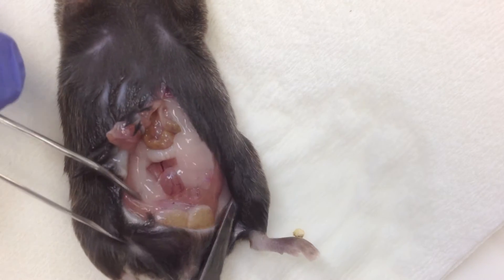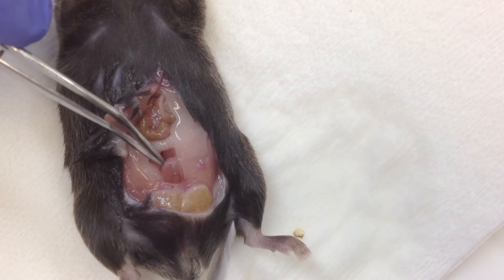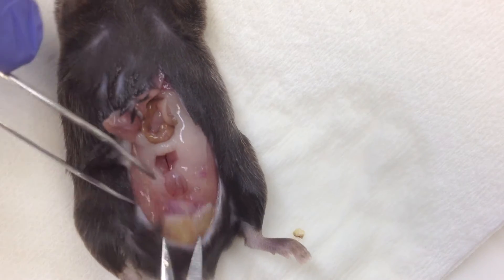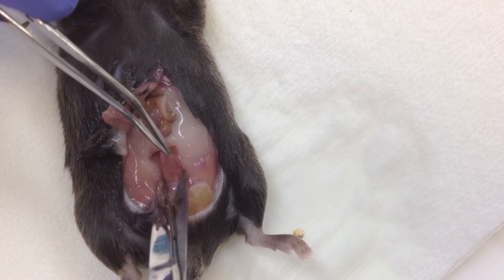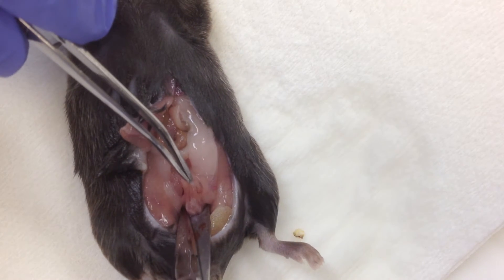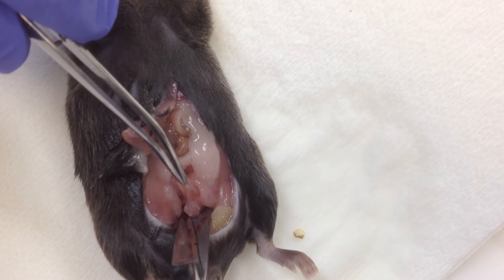Locate the bladder, which is as observed right here. What you want to do is insert the scissors on either end of the bladder, and as caudal as possible until you can hit the very base of the bone.